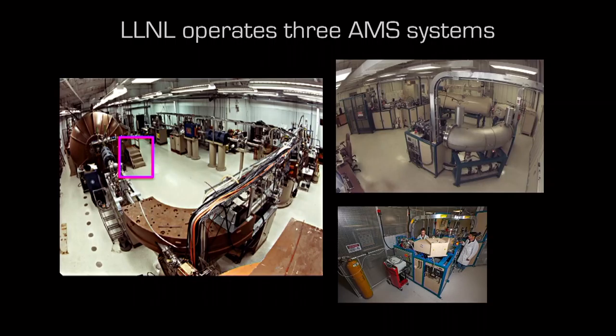And then the medium-sized one up in the upper right, that one is used mainly for analysis of natural carbon, to analyze samples that just have natural C14 in them through the atmosphere. And that's done for carbon cycling as well as dating and geochemical purposes.